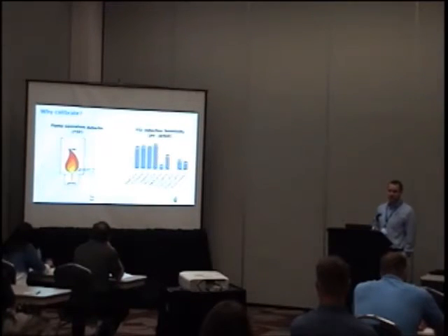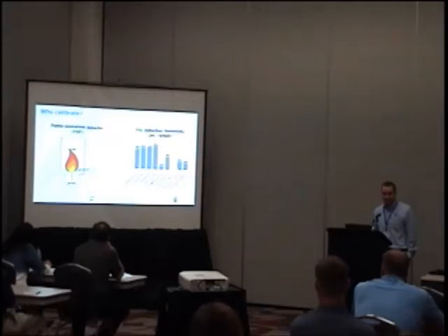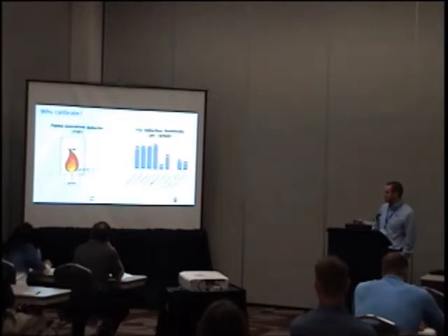Now for straight chain alkanes, the sensitivity, or the number of carbon cations that are formed, is about 1 in every million carbons you form a carbon cation. And that sensitivity is roughly the same for methane all the way up to C30s. There might be differences of about 10 to 20%. But when you add an alcohol group or an acid group, that sensitivity can go down 5-fold or hundreds-fold, where you don't even see that in the FID anymore. And this is because these alcohol groups or these functional groups change the propensity in this flame to form those carbon cations.